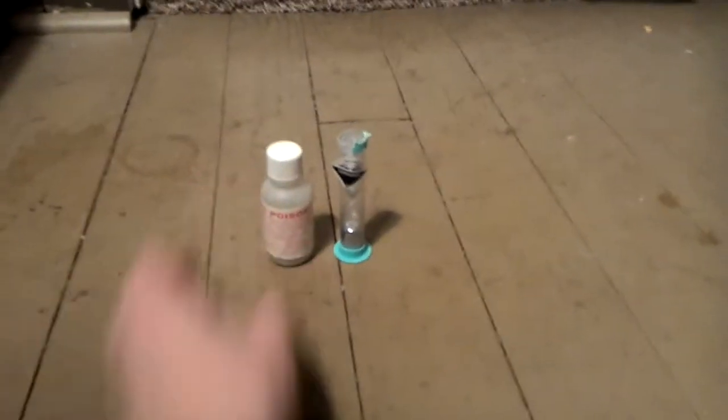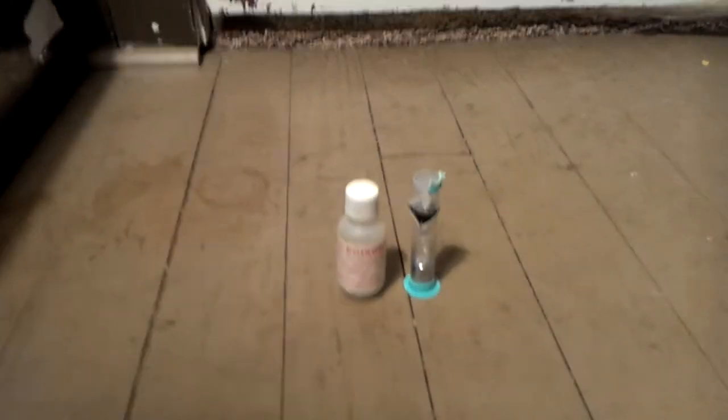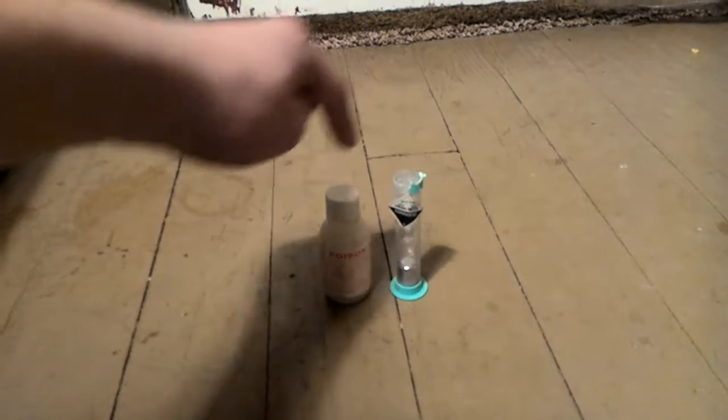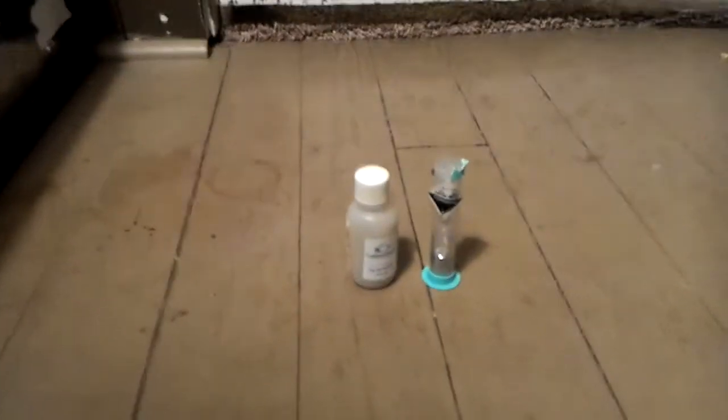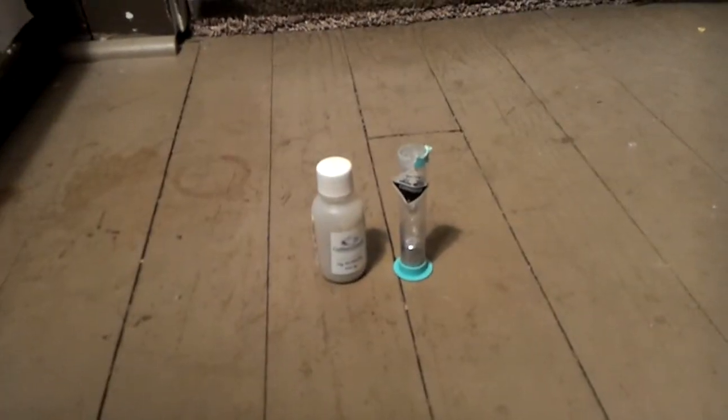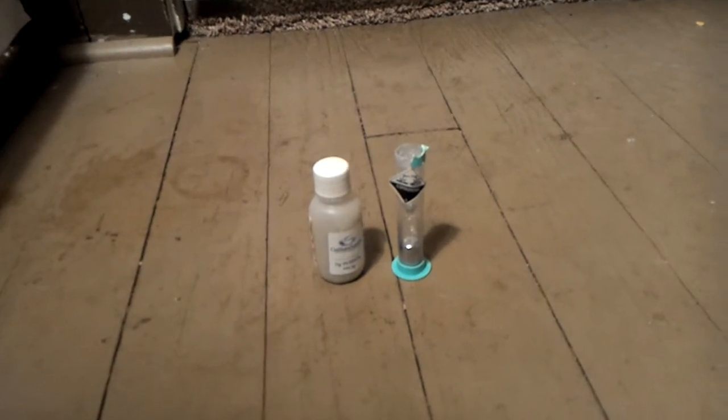So, I have two different types of storage containers. One of them right here is glass, and this one is the original bottle, which is like a plastic. Now, I'm going to be comparing them. And so, I guess let's start.